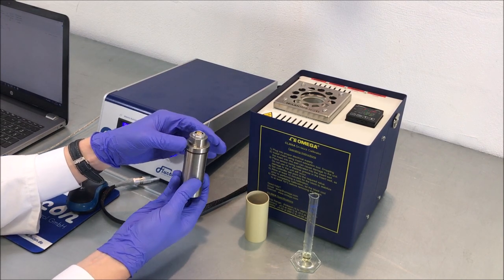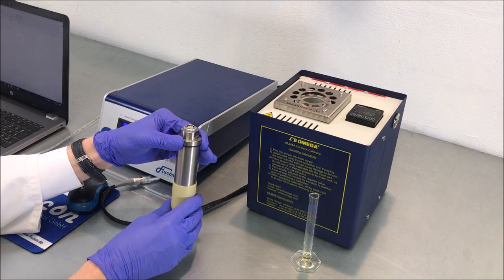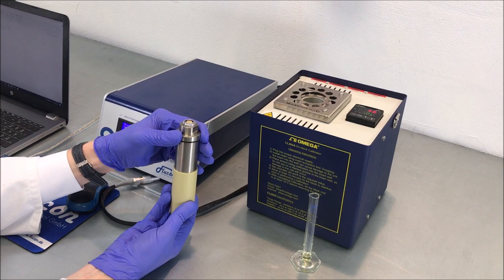Once the cup is screwed on tightly, mount the heat resistant adapter sleeve which adapts to the inner diameter of the thermostat socket.